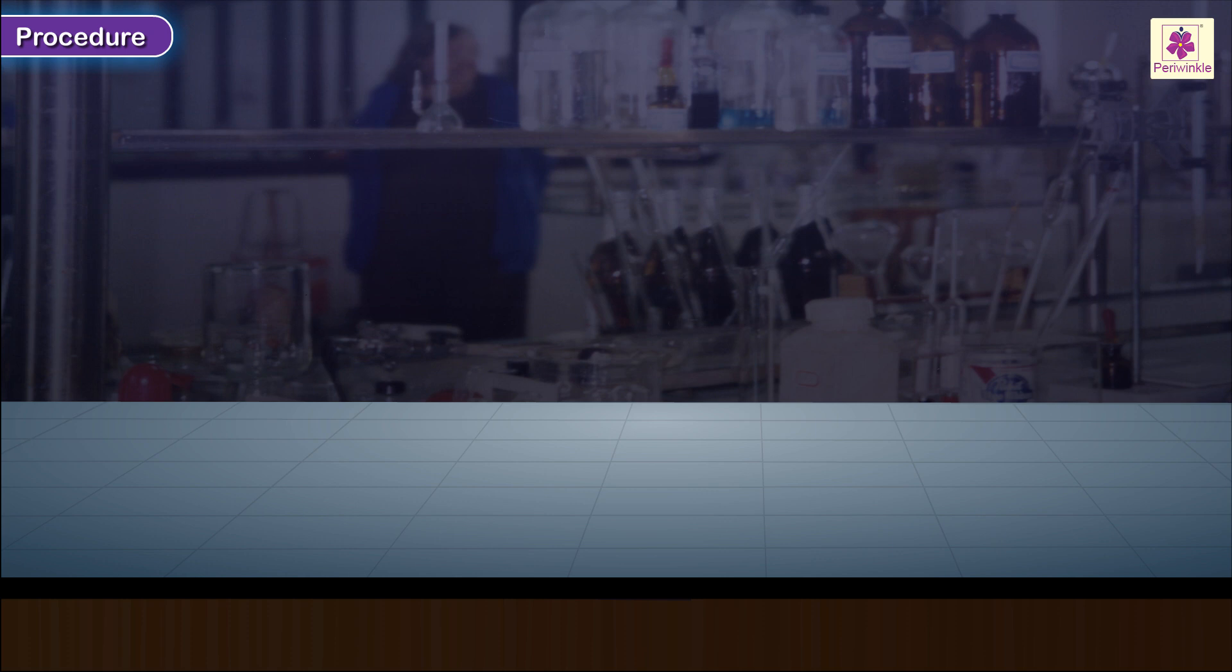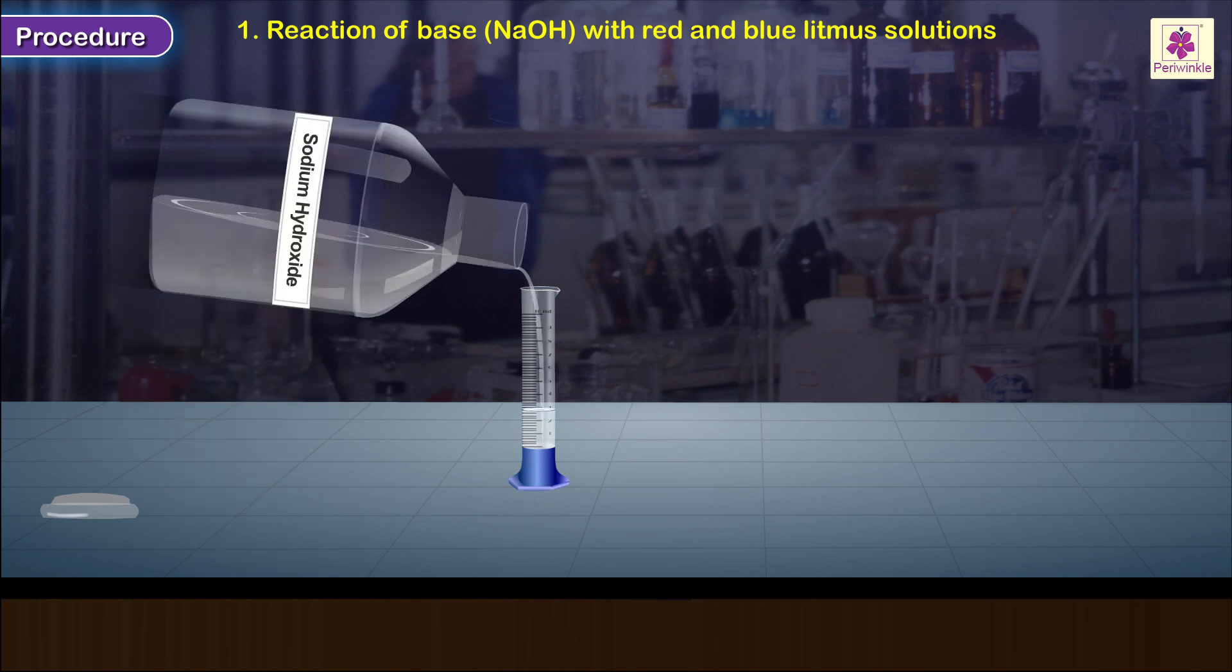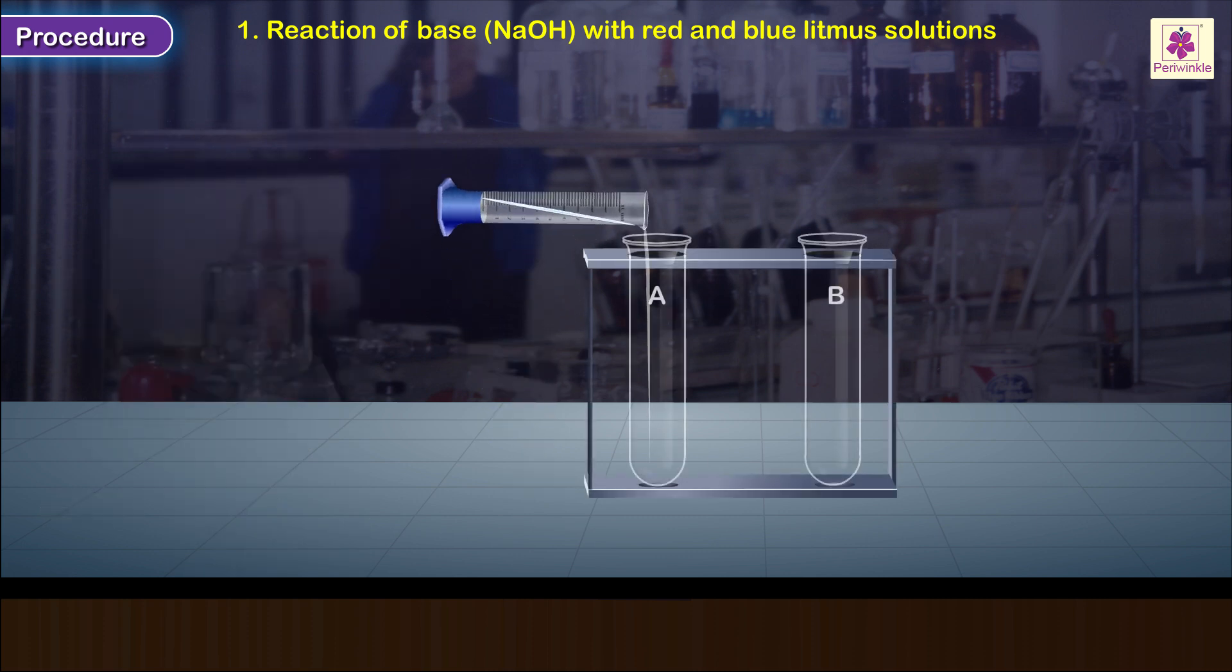Procedure to study some properties of bases. One: reaction with red and blue litmus solutions. Take two test tubes, each with about 2 ml of solution of sodium hydroxide. Place them in a test tube stand.